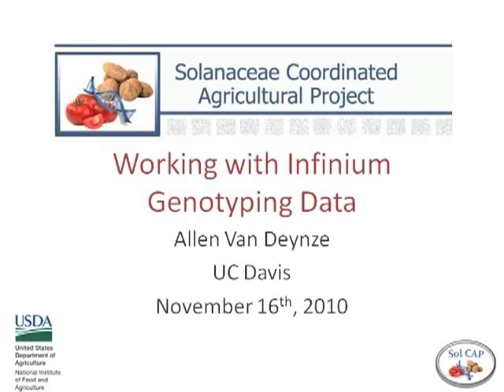What I'm going to do is, there's a number of slides that you guys can follow through, but I'm going to go through Genome Studio and explain what that is.